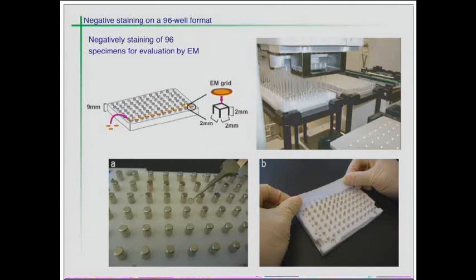We then have 96 after the crystallization. The crystallization can take up to 2 weeks. And the dialysis block is able to dialyze DDM and other low CMC detergents by doing several exchanges and so on. So that works well.